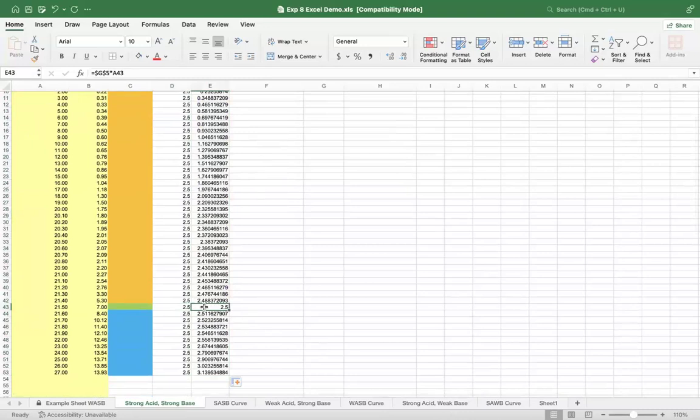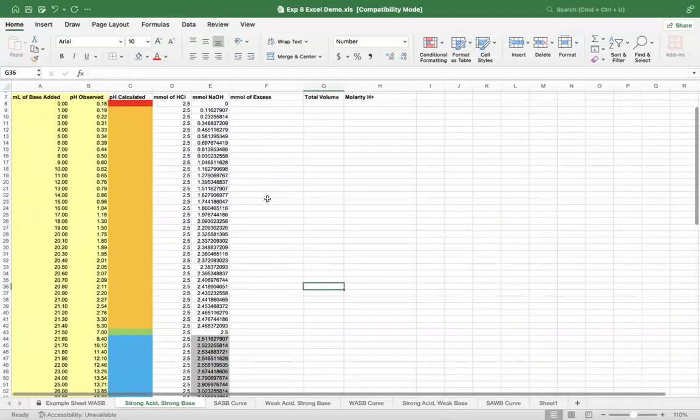I have an exact neutral point here. This is mock data. You probably don't have this exact point where your pH was 7. That's okay. You will see a point, though, where the amount in this column starts getting bigger than the amount in this column. I usually like to just change the color of the background when that happens. You don't have to do it, but I like to just give myself a little bit of a way to know I'm dealing in a slightly different sort of calculation space. Okay, so that's where we exceed the amount of base or acid present.